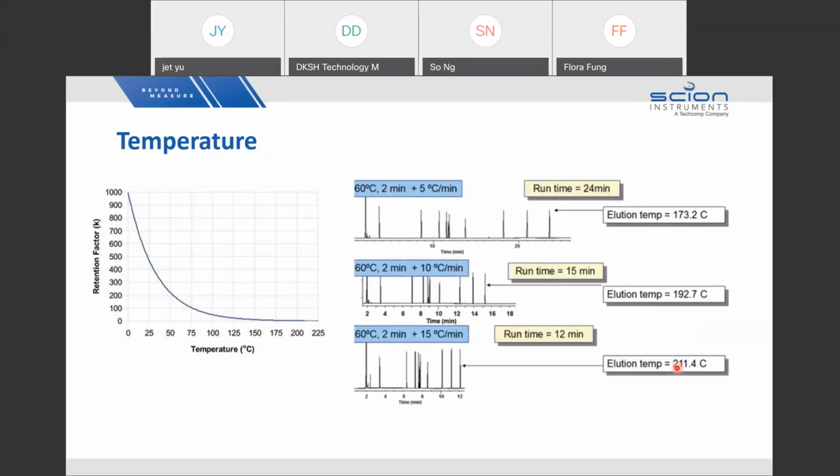Okay, you look at these chromatograms. Here we just simply change the temperature programs. Okay, so this is the initial one, so the run time is 24 minutes. You look at those late eluters. So there are only 4 peaks. Then they are still far away. Okay, far away means there's less risk for you to come across separation issues. They are still far away. Okay, then why not increase the temperature after this point? Okay, you increase the temperature of the GC oven, so you're able to help elute these 4 peaks faster.